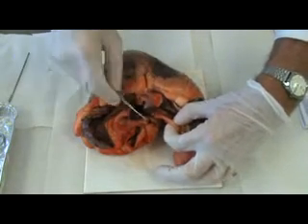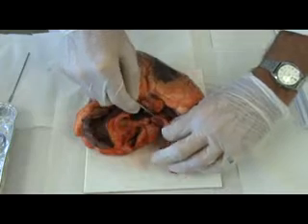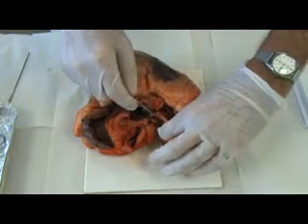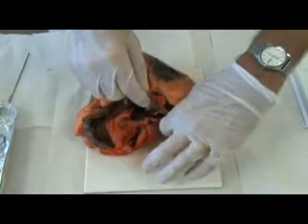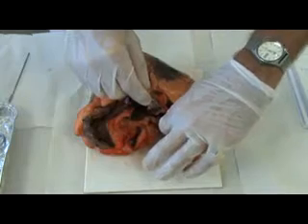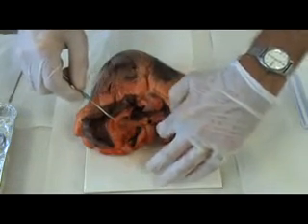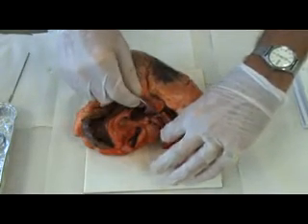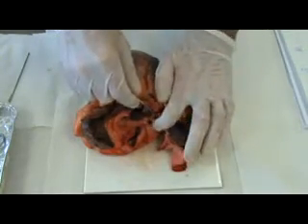The aorta is the largest artery, and it's carrying blood at high pressure from the left ventricle to the rest of the body. And if you put your finger in there and rub it along, it's got a very smooth surface. Also important to reduce friction that might otherwise cause a clot to form. So we don't want any friction present.